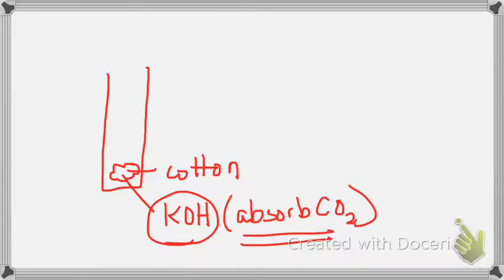The thing about potassium hydroxide, like I said, is that it's pretty caustic, so whether you're working with peas, mealworms, or something else, you don't want the critter sitting right on top of the potassium hydroxide. It's not nice stuff. So in between, you're going to put a very thin layer of rayon. Rayon kind of looks like a cotton ball, but it's non-absorbent, so the liquid won't pass up through it. It's a little separator, but like a cotton ball, air can certainly pass through it. You need that to be able to happen.